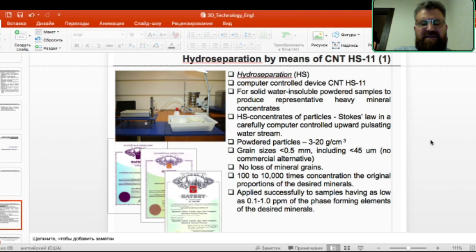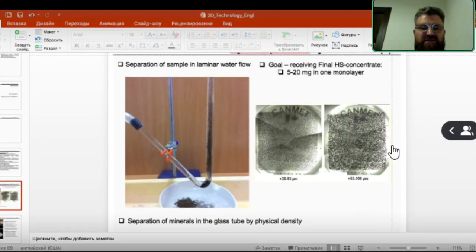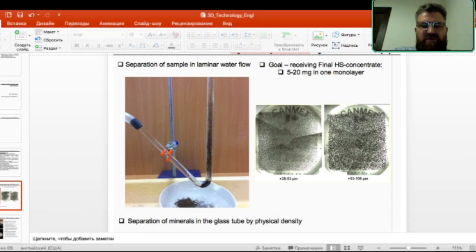So any water is used, just tap water, same as with EPDs. So we all work with the same water. We can actually work with the same water that's left over from EPD, basically. So it's all the same water can be used.